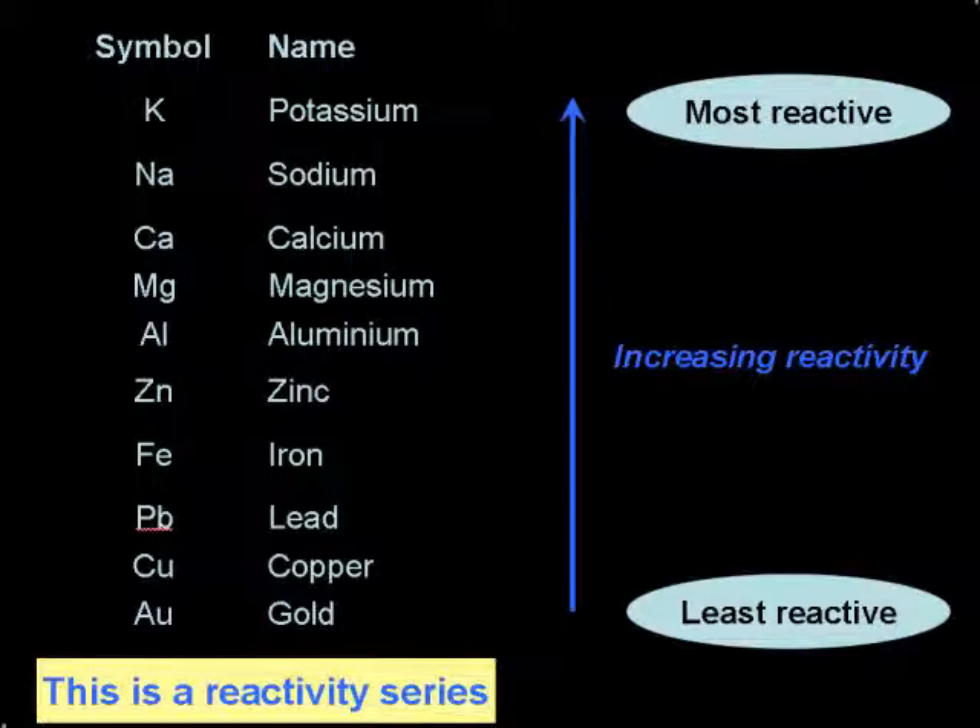So we should see a reaction between magnesium and copper sulphate, with magnesium displacing copper. This will be seen with copper particles being formed in the test tube. In the other case, copper is below magnesium in the reactivity series, so copper should not be able to displace magnesium from magnesium sulphate. Hence we should see no reaction. Let's see what really happens.